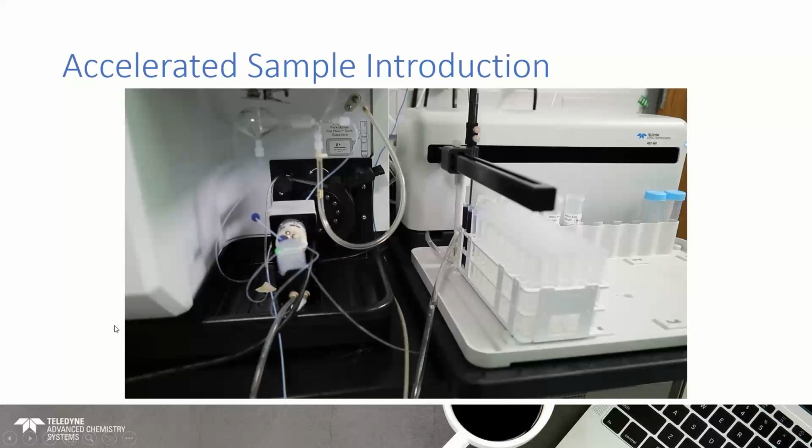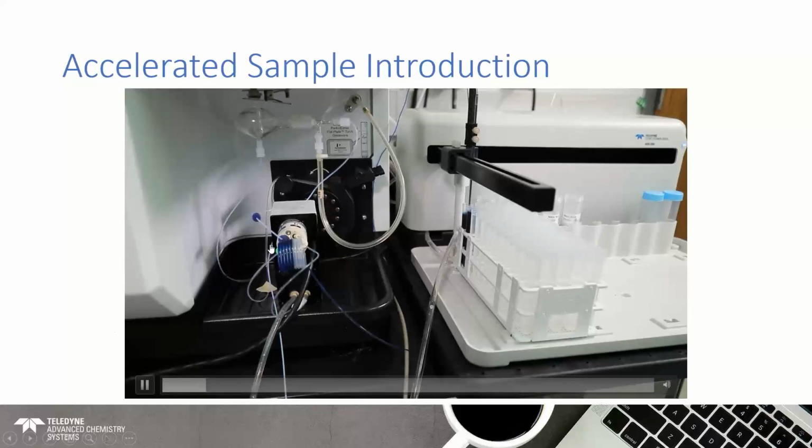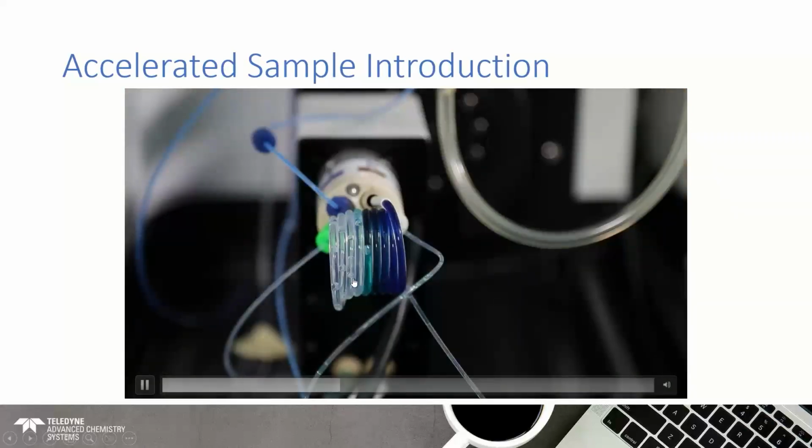So just to show you, I'll talk you through what's going on. The system very rapidly pulls up sample onto the sample loop, the valve switches, and then our carrier solution pushes it very quickly off the sample loop and pushes it to the nebulizer.